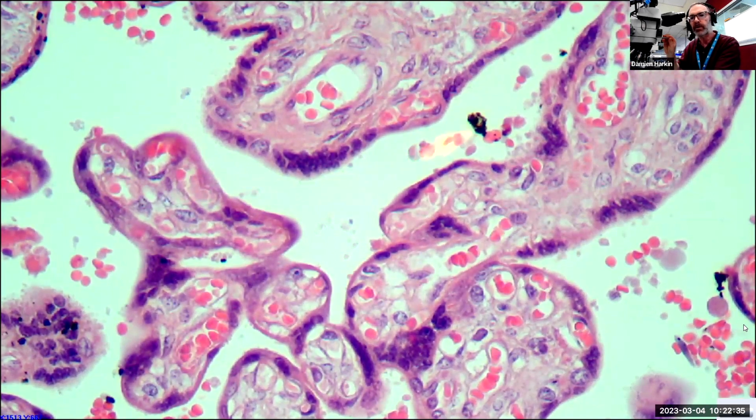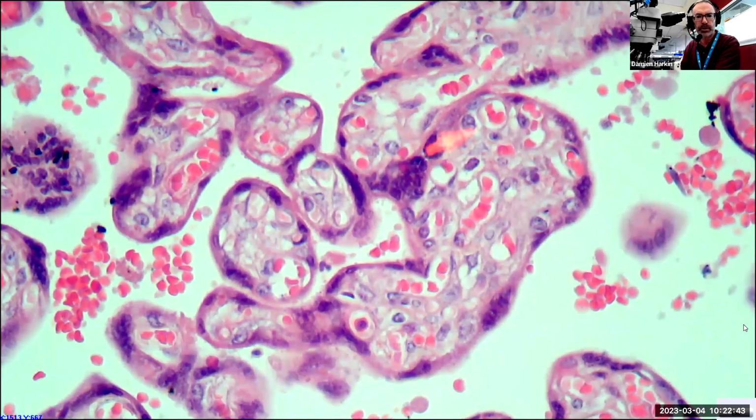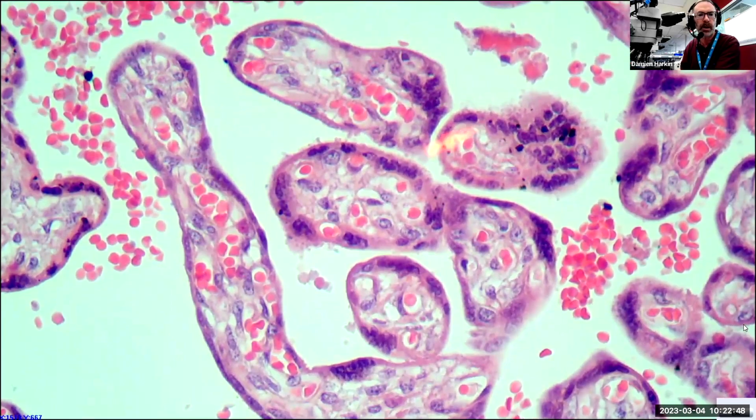Well, an experienced histologist may be quite familiar with coming across that and has no issue with it. Likewise, pathologists responsible for making diagnoses are probably not going to be overly concerned by that.